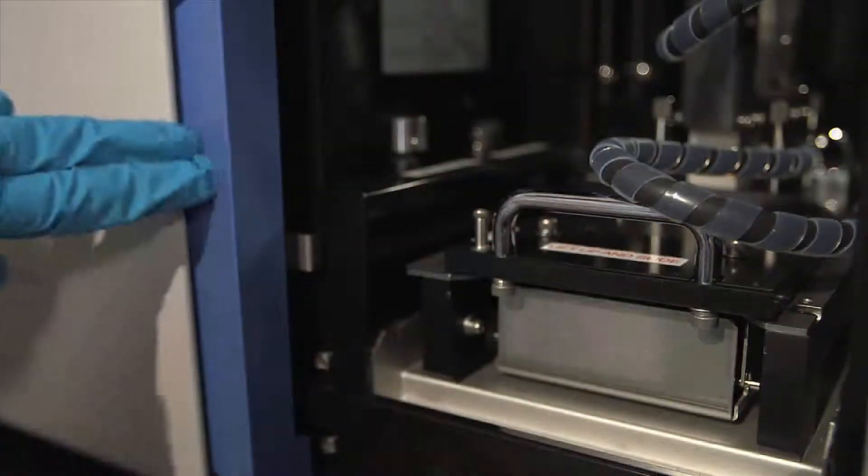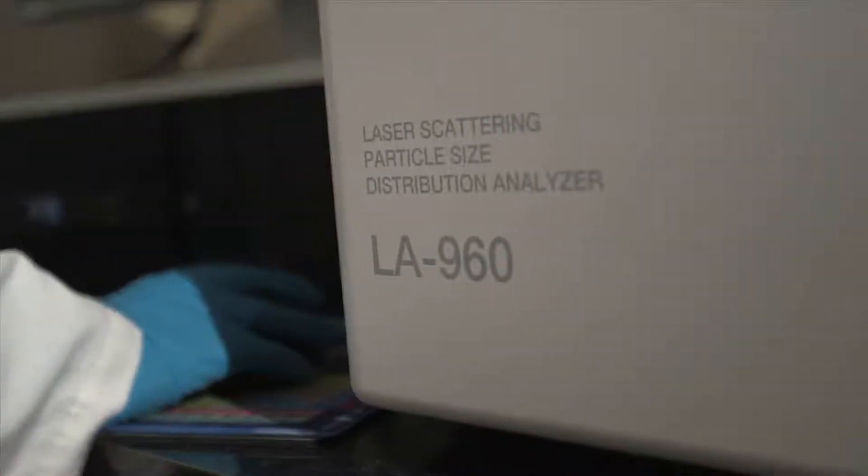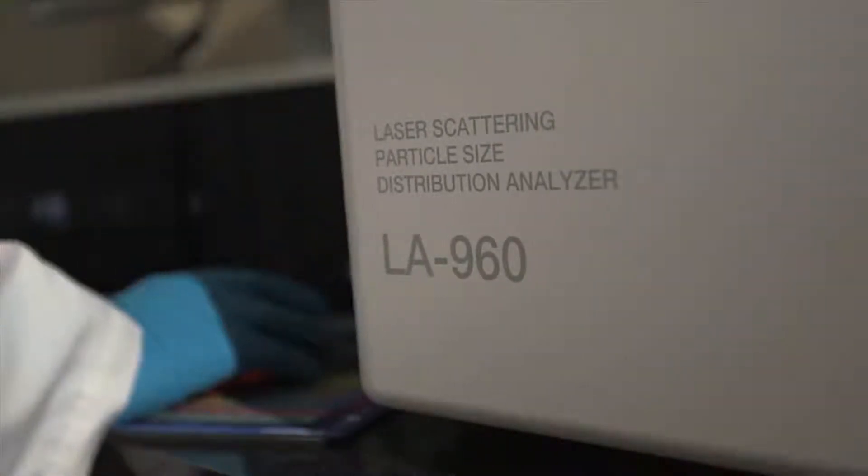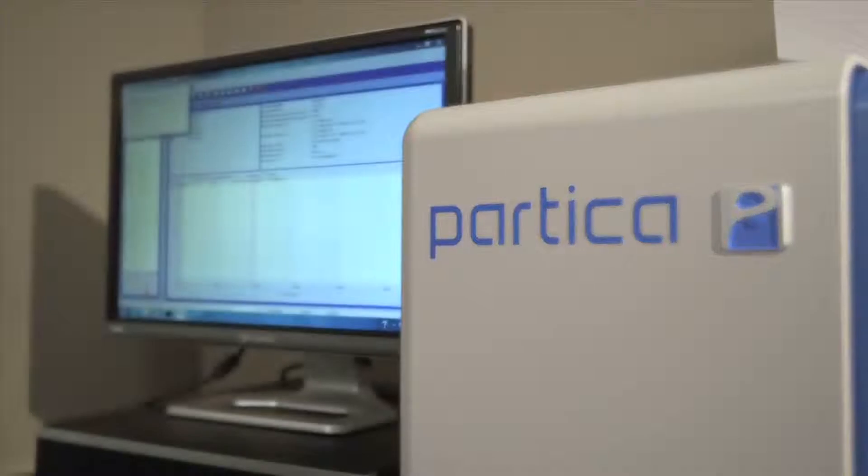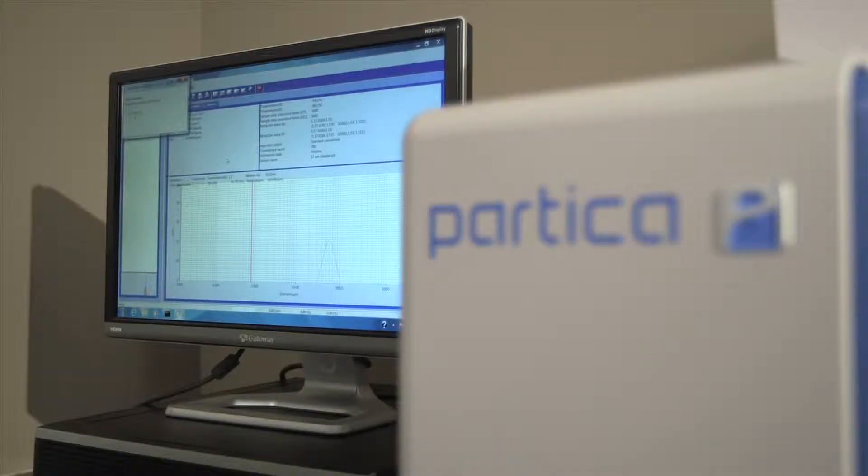Building on the successful LA950 platform, the LA960 combines intuitive software with the industry's most powerful sample handlers to produce trustworthy results. I've been very impressed with the reliability, quality, and most importantly their customer service.